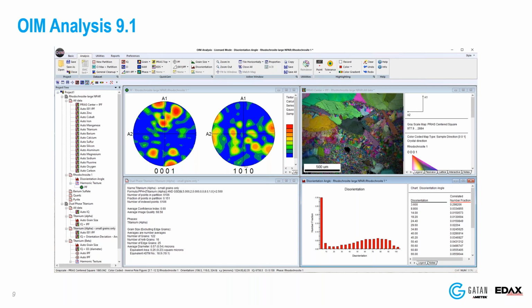Now, this is what the software looks like. If you've used the software before, you'll notice that the toolbars look a bit different. We have on the top of the screen here a ribbon bar. And in the ribbon bar, we have combined the different toolbars. We combined all the functions. And the most important one for now is this section here, the quick gen section.